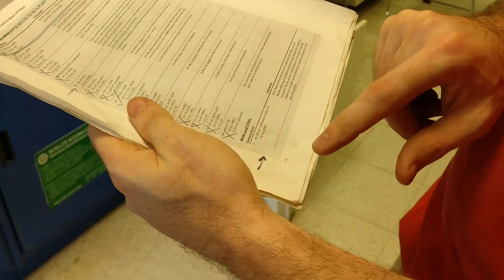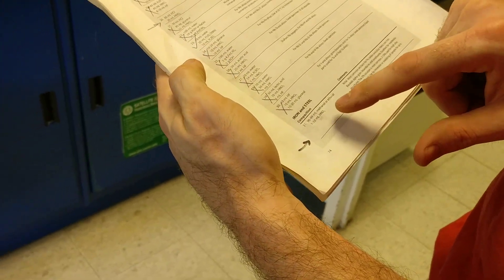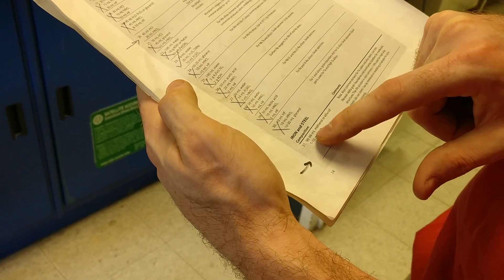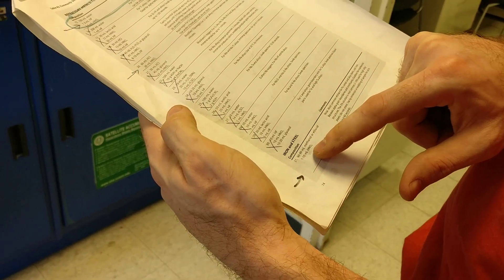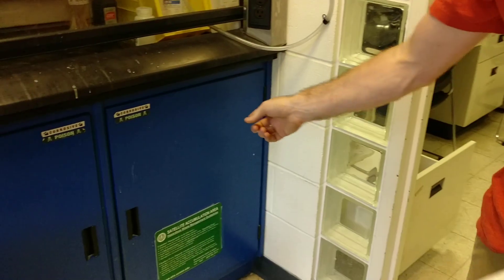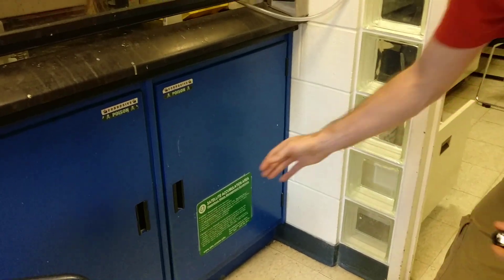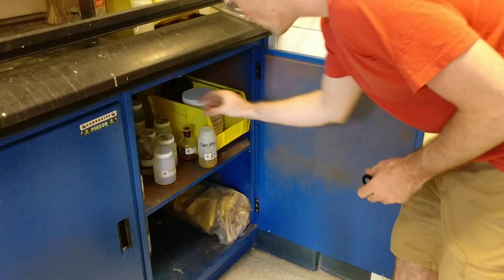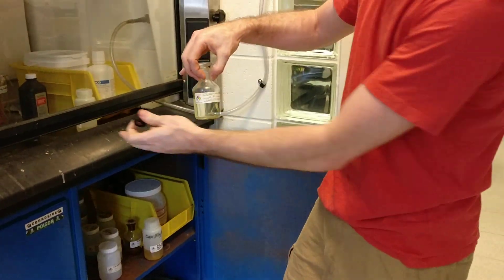So we have iron and steel here. We're going to see that this is called nitol, which is mostly methanol with a little bit of nitric acid in it. That is located underneath the fume hood here in this glass container.